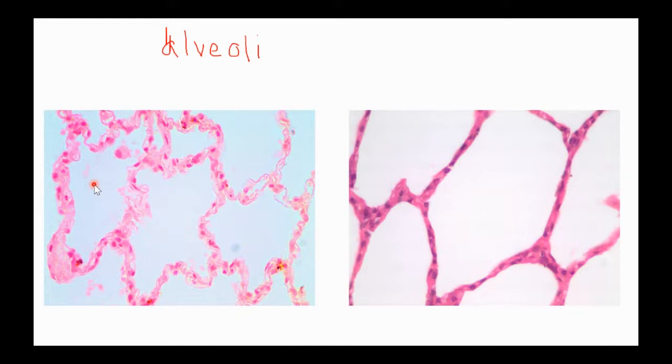These cells have one layer, or this tissue has one layer of cells, and those cells are really squished. So check out over here how I'm seeing this one line, and every so often in this line I'm seeing the little purple dots. Those little purple dots that you see are the nuclei of the individual cells. So in simple squamous epithelium, the dark spots that you see are the nuclei of the cells, and all of those cells are kind of arranged in one line. They overlap each other a little bit, but I have one line of cells.